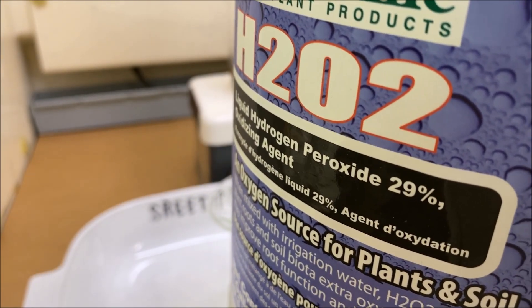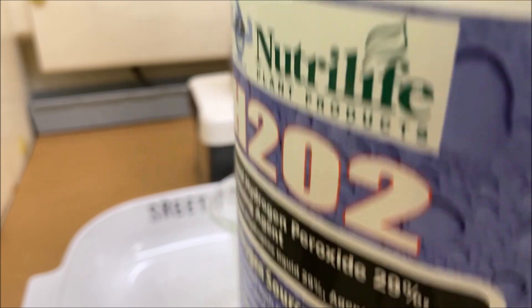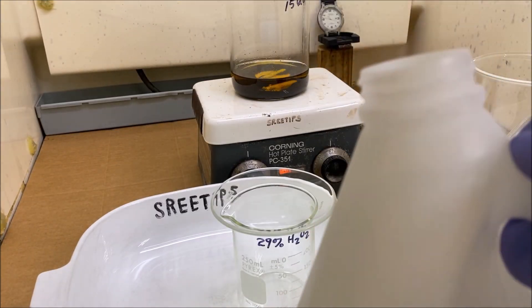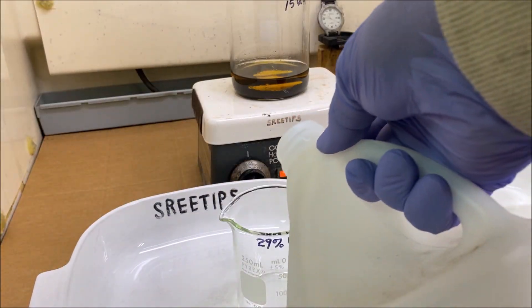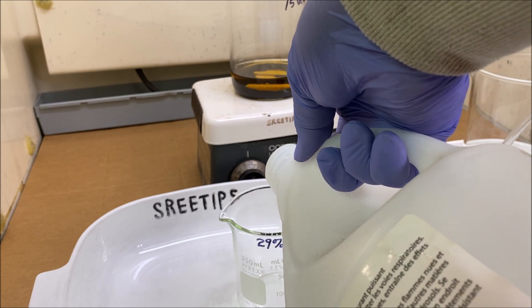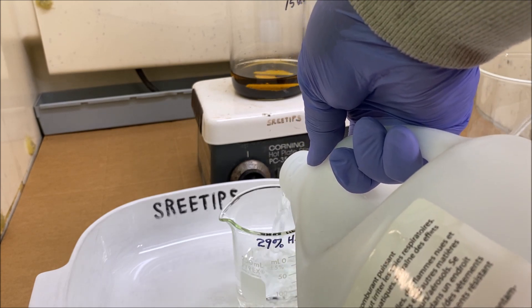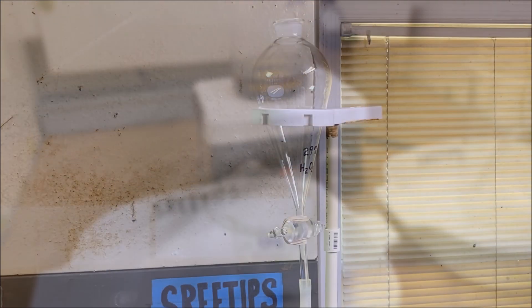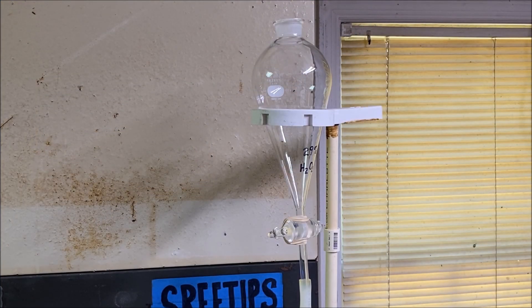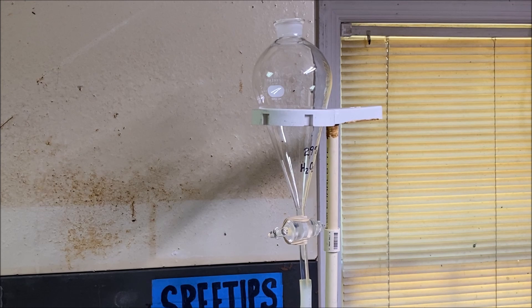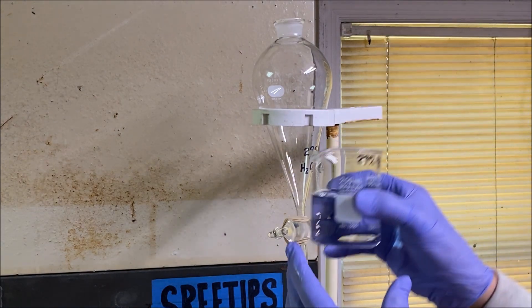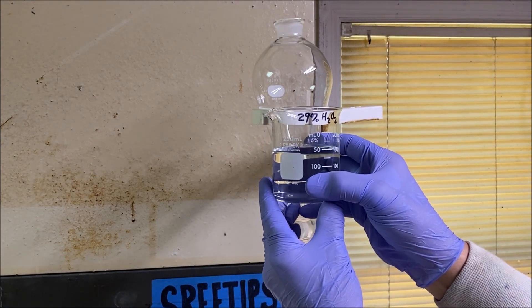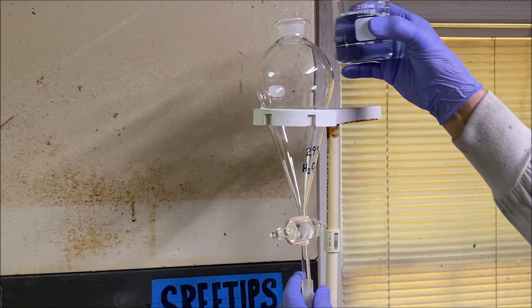For the next step, what we're going to do is measure out some 29% hydrogen peroxide. I'm going to go with about maybe 200 milliliters. I've got my delivery apparatus set up outside the fume hood. I'm going to add the hydrogen peroxide to this funnel.